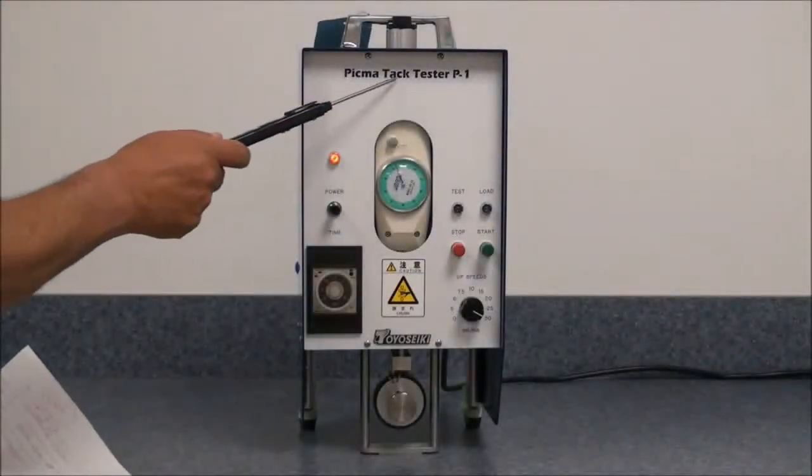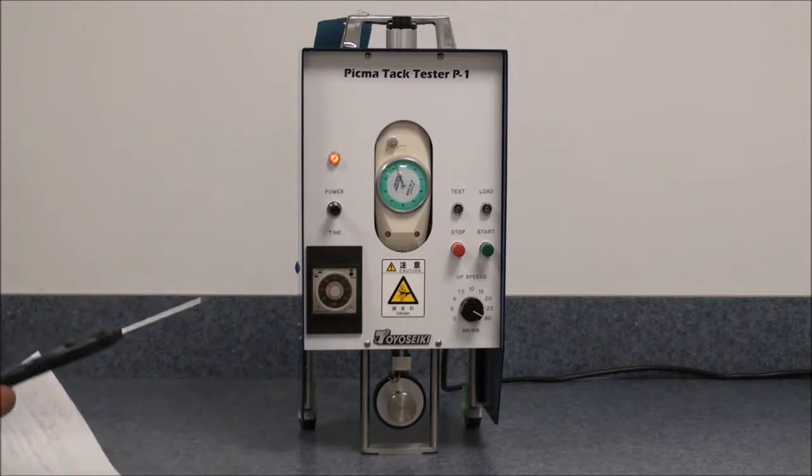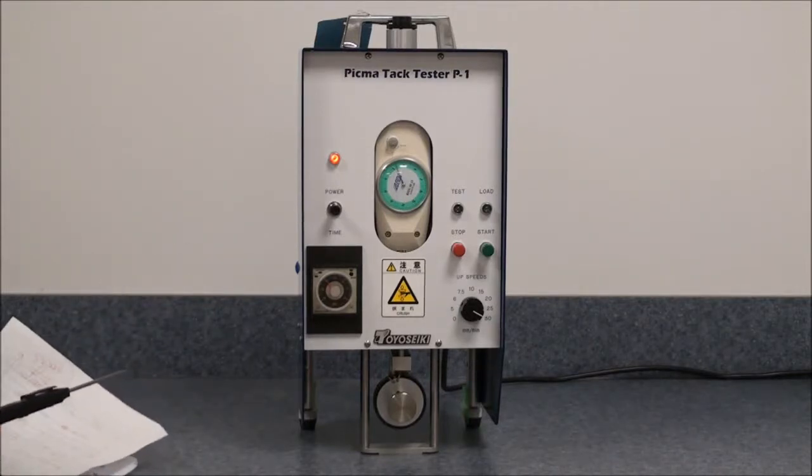This is the PICMA TAC tester model P1. The unit has a range of 0.1 newton to 15 newtons.